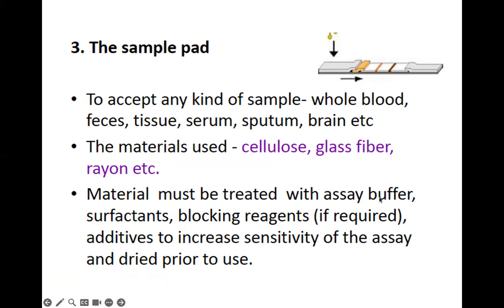If the assay buffer requires you to prepare a certain pH, then you have to prepare the whole thing first before the analysis can be done. This part, which is the buffer, surfactant, or blocking reagents, has to be characterized. If not, then you will not get the reading.